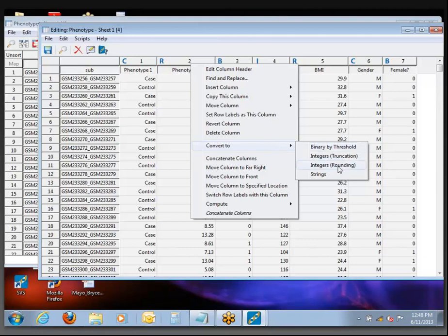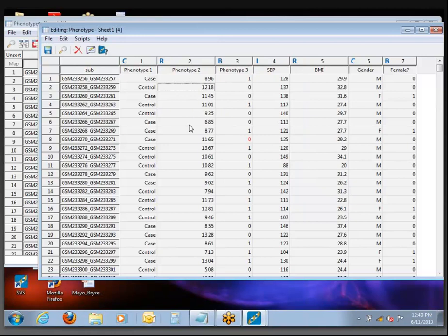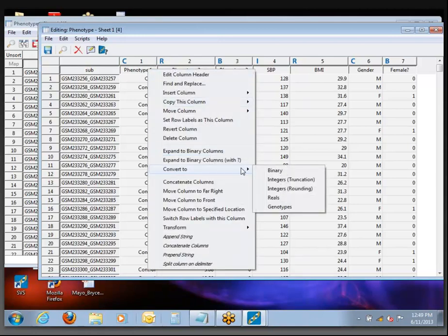Since it's already a real number value, there's no option to convert to reals. But as long as there's no data that directly prevents it from being converted to a number, it will do it here. What we need to do so we can continue with the tutorial is convert Phenotype 1 into a binary variable. That's because in SVS, when we're doing association tests, the dependent variable used to specify phenotype has to be a number — either a binary 0/1 flag, integer, or real number type. We can't support case-control testing when you just have the words 'case' and 'control'.